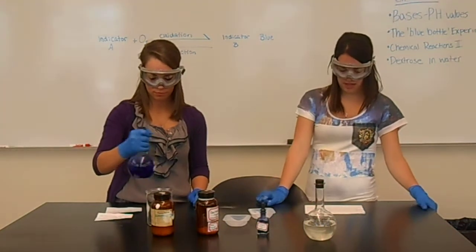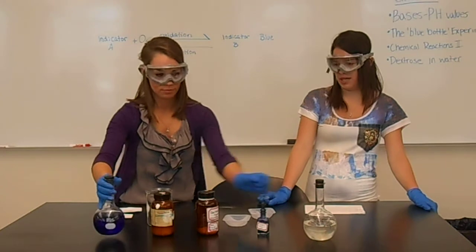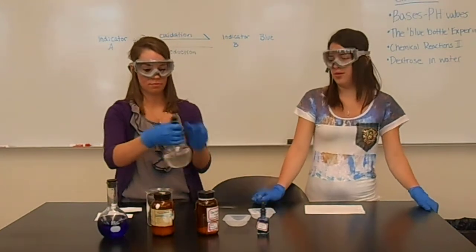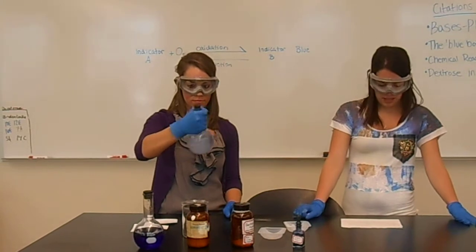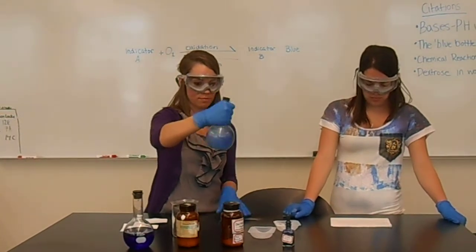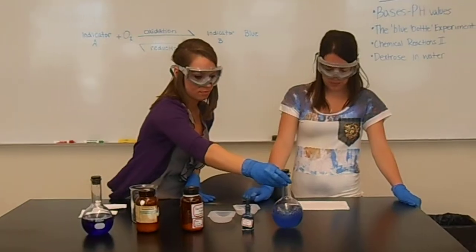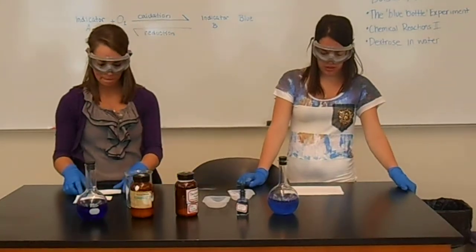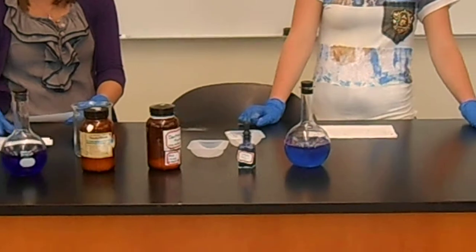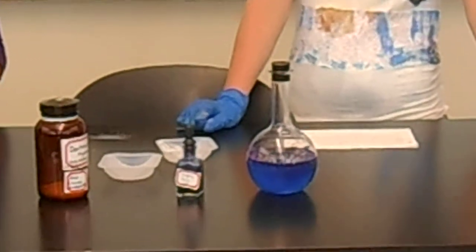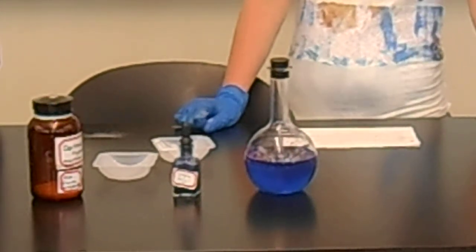We will then swirl the flask and allow it to sit for about a minute. We actually already made a pre-made solution to save some time. Once that's shaken, the flask will then turn blue so the color appears, and then again slowly fade into the colorless stage. You can repeat this step as many times as you would like.